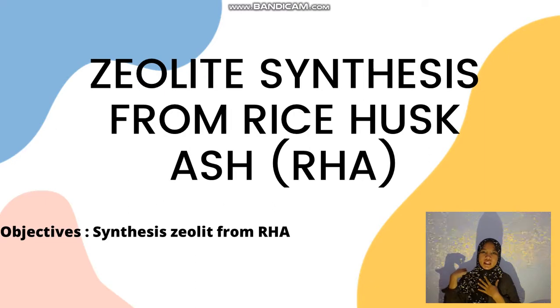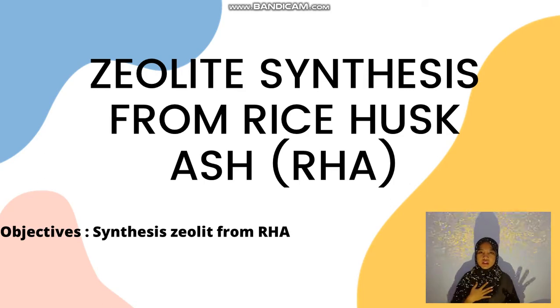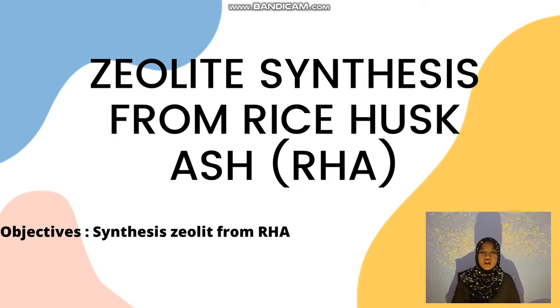My name is Cindy. I'm from Chemistry Education Class B. In this video, I will discuss the result of my practicum. The module is zeolite synthesis from rice husk ash, or RHA. The objective is to synthesize zeolite from RHA.